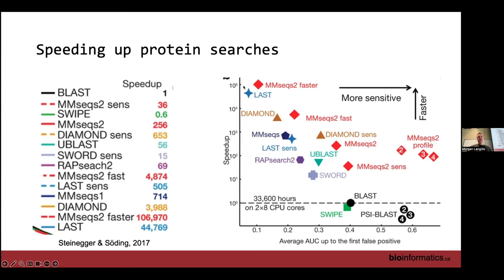What I mean by that is that you have to essentially have a path through this for the module to be complete. So no matter what, you would need this KEGG ortholog, then you would need either this KEGG ortholog or one of these and one of these, one of these four, definitely this one, and one of these two. Pretty cool stuff. And that's actually what this is represented as textually over here on the left. So it's kind of nice because then you can really say whether this module is complete or not.